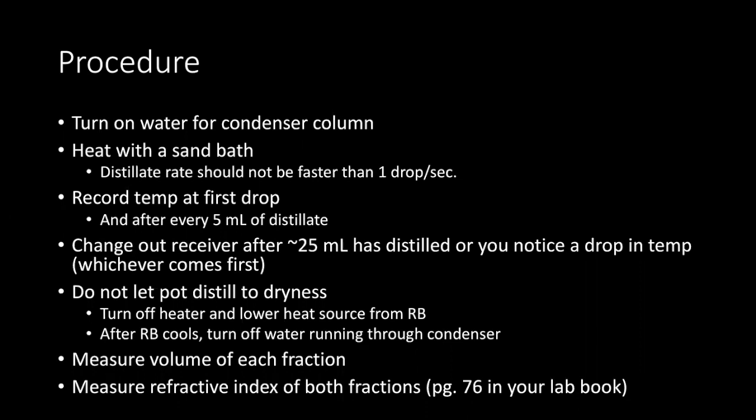We will be heating with sand baths. We will not be using Bunsen burners. And you can control the heat of the sand bath so that the distillate rate should not be faster than 1 drop per second. Basically, you should not be observing more than 1 drop of liquid or distillate, as we would call it in this lab, coming off and being collected in your graduated cylinder per second.